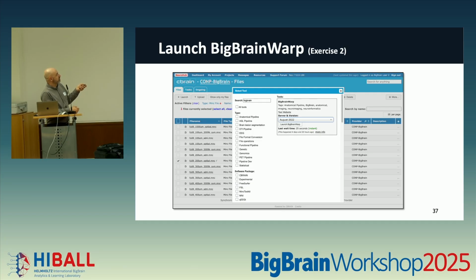So if you type that in, once you put it in, it should autocomplete and present to you the BigBrain tool set information. So it gives you an identifier showing what tags of processing type of tool it is, links to the website. So again, we're not the definitive source of information regarding the tool. So you always should have a good understanding of what that tool is intending to do. That being said, we do provide some help menus that link and take information from the tool source to help guide you along to provide some additional information. Okay.